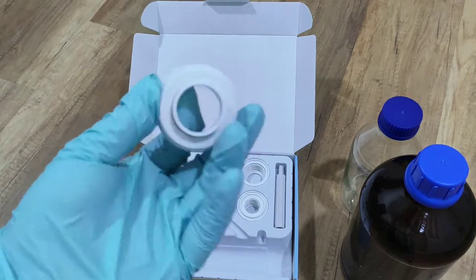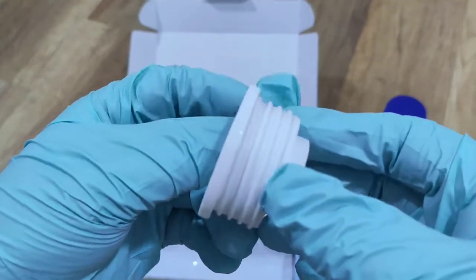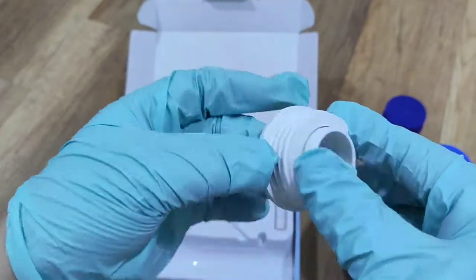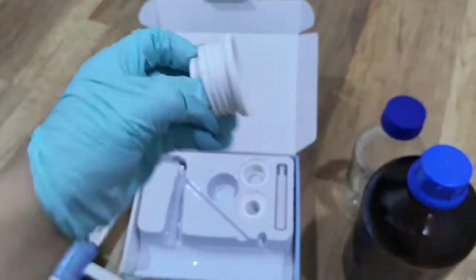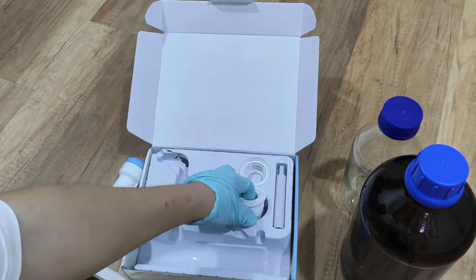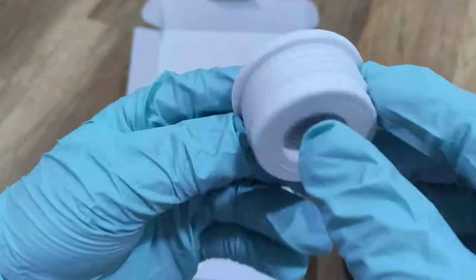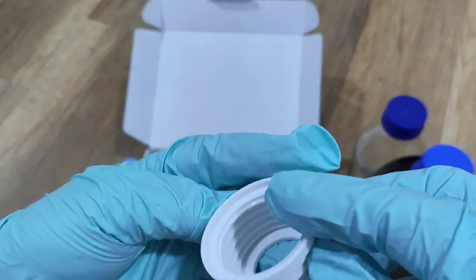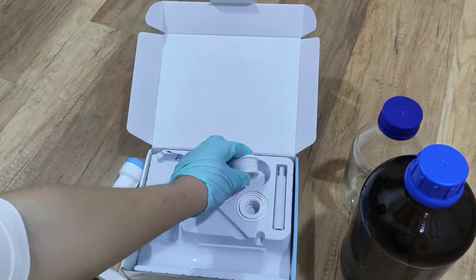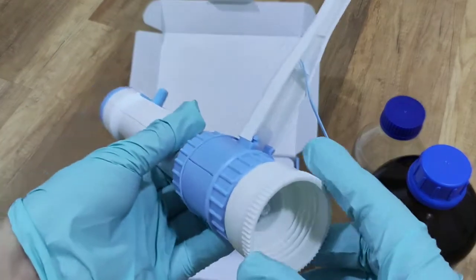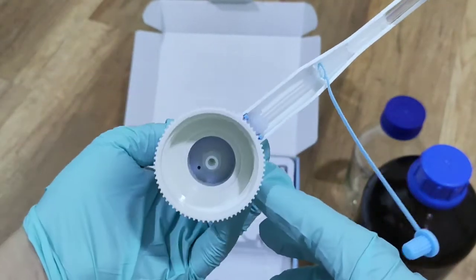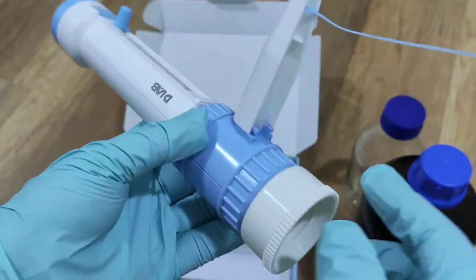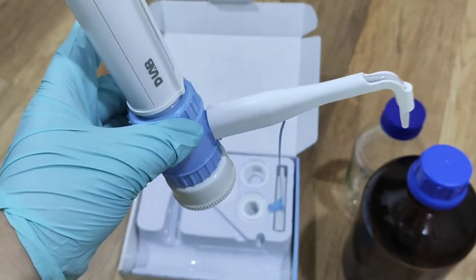And we have these adapters, adapters to different sizes of the bottle. This is one, this is another one, this is another one, this is the third one. The original design for this cap is adapted to GL-45, so normally the Schott bottle can be used. It can be used here for GL-45.